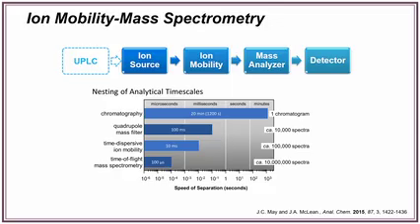The mass filter is operating on a range of milliseconds, right, hundreds of milliseconds. The ion mobility dimension is 10 milliseconds to maybe a little bit longer if you're doing higher resolution. So maybe you're still in the millisecond range, but maybe you're getting more to like 50 milliseconds or so. And then the time of flight, the mass analyzer, is working the fastest. So you have this perfectly nested Russian doll time scale setup so that for every chromatographic peak, you have multiple ion mobility experiments happening. You have many individual mass spectra being collected across that ion mobility experiment.